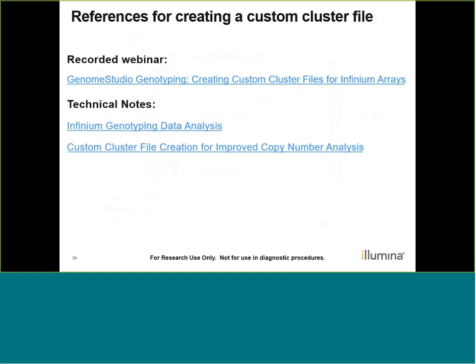We have several resources, including a recorded webinar, and I've provided links here, and then two technical notes. One, Infinium genotyping data analysis, which provides step-by-step instructions for creating a custom cluster file. And the second tech note is really more specific for copy number analysis. And it discusses the fact that it may be more important for you to create your own custom cluster file if you want to get the best copy number analysis.